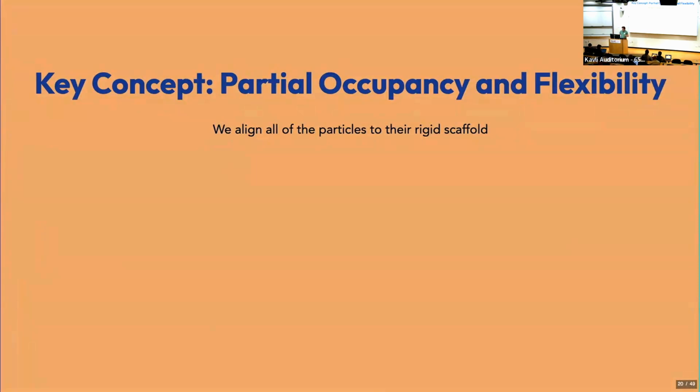So what we're doing here is aligning all of the particle images to some static volume, right? Remember that forward model. We treat all the particles as if they come from one single static volume, okay? But we know the particles themselves, as they are either bound or unbound to this ligand, the thumb will be in position A or B, and maybe it'll be somewhere in between, right? But it'll either be an apo or ligand bound state, probably.